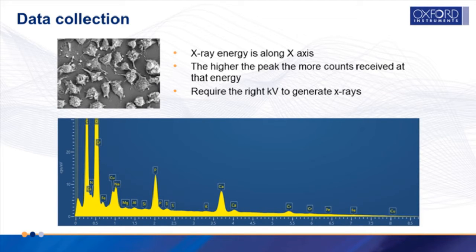There are two things to note here. In general, if you want to achieve the higher energy peaks, you may need to use a higher accelerating voltage, at least 2.5 times the voltage that you are hoping to activate. This is generally more of a challenge in SEM, as TEM voltages usually mean this is not an issue. The second point is that many biological elements are light elements and do not have higher energy electron interactions. In those cases, increasing the kV will not help to extract more information.